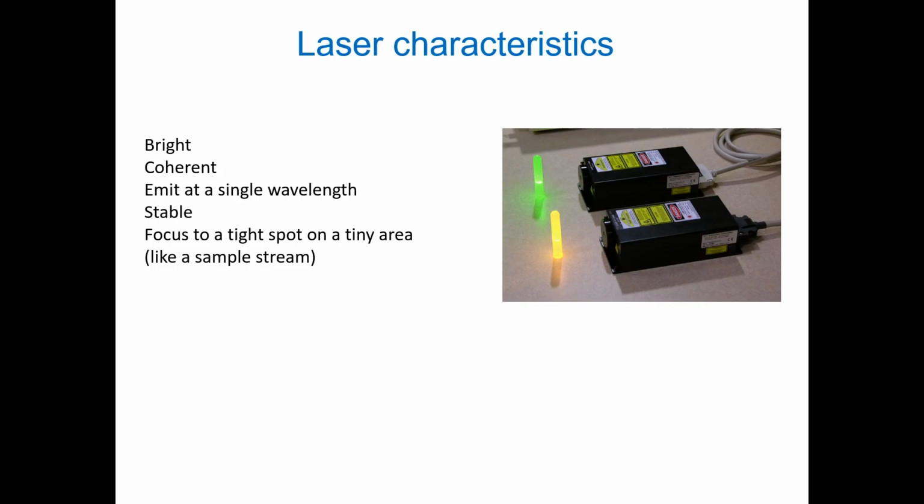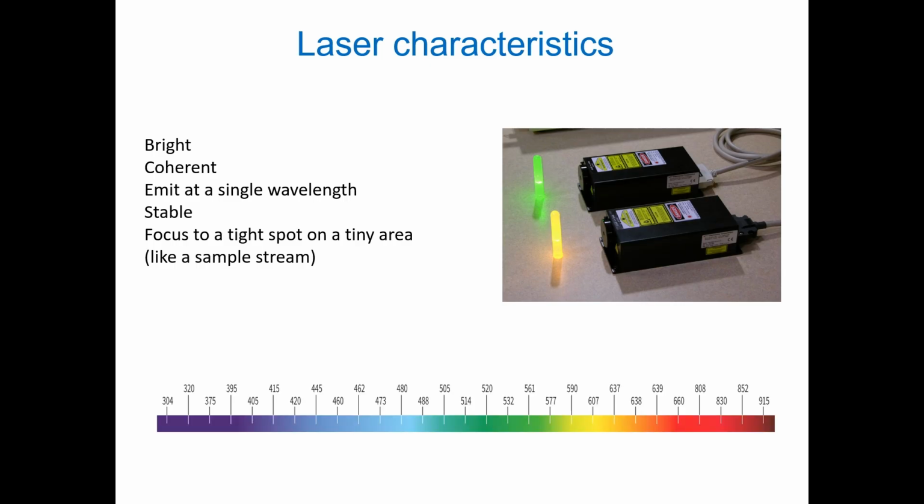In the last 30 years, lasers have evolved from huge, expensive water-cooled lasers to becoming very small, powerful, much cheaper, and are available in many wavelengths.